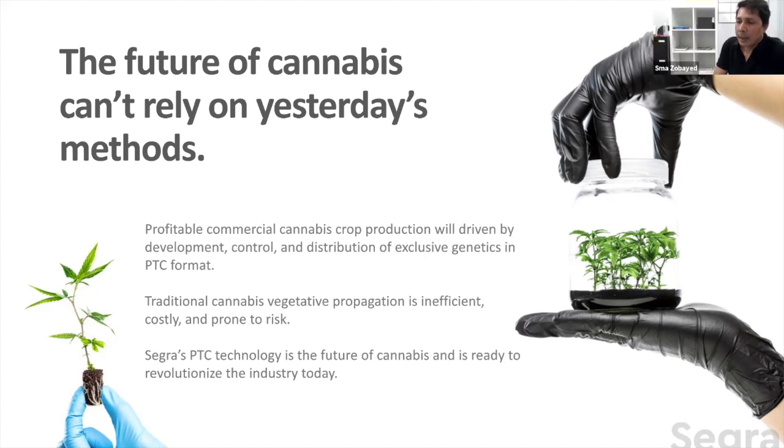The first one, I would say, is that there is always a chance of receiving contaminated plants, because this industry was hidden for so many years. People are using mother plants from mother plants, and they are using cuttings, and then intercellular bacteria. I receive so many plants which are loaded with intercellular bacteria. So initiation takes longer.